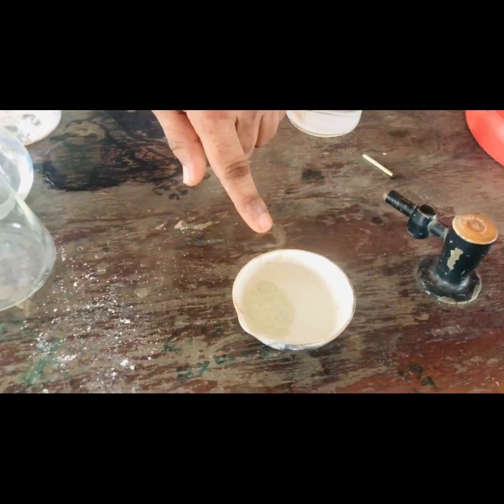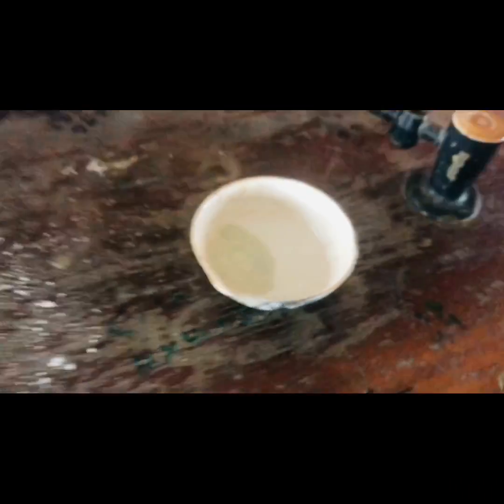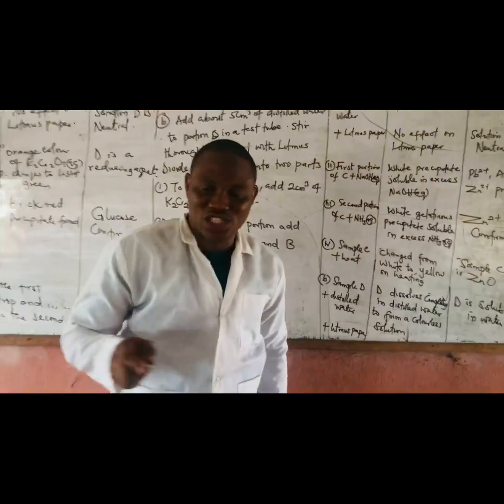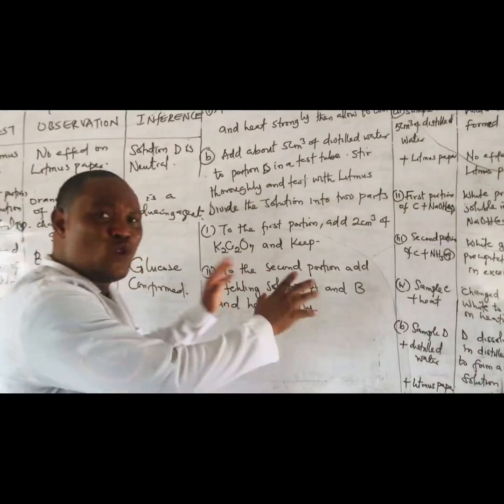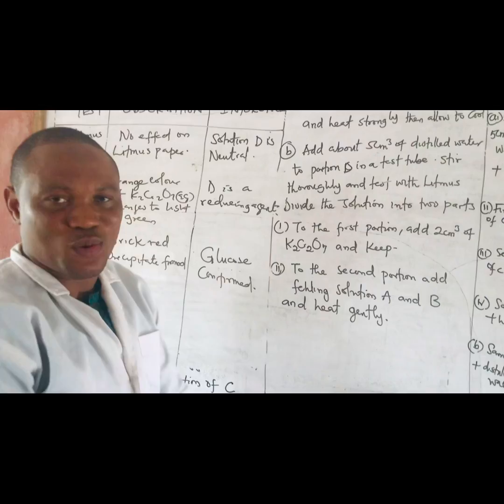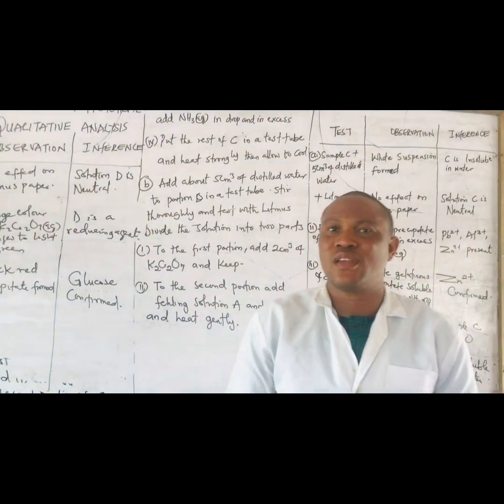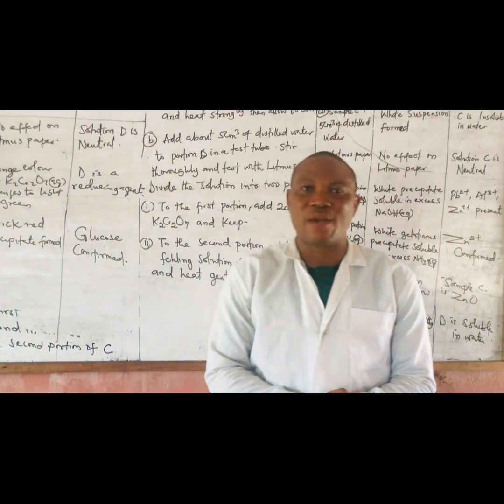We want it to change back to white on cooling. It was yellow before, but if you leave it for hours now, it's going to change back. And that's all. If you know this, I am telling you, this is 80% correct. I can assure you that. And we are doing this practically to help us grow in chemistry. So this is just it.